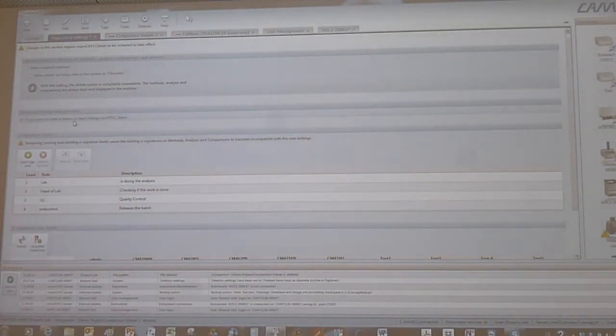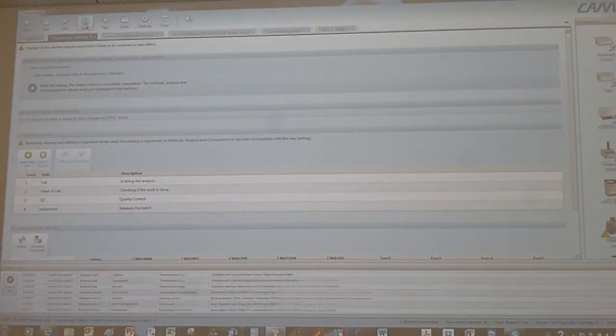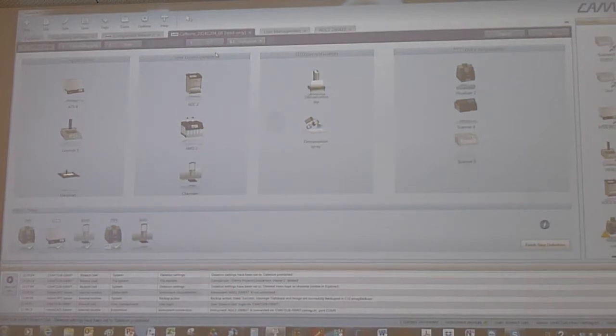So you have to say why if you do something. We did that now, I think, in a quite clever way, because usually if you activate this, the lab guy is killing you. Because every time he changes something, he has to enter a reason. And he ends up with ABC, ABC, ABC, or something like that, because he's getting crazy about that.